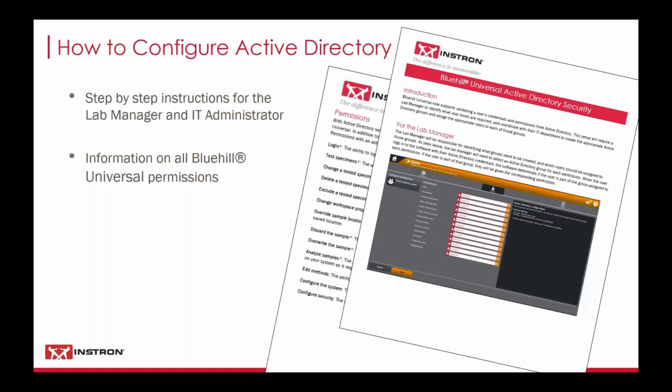And if you're interested in setting up Bluehill security with Active Directory, similar to that demo that we just went through, we have a helpful document that you as the lab manager or super user can share with your IT department. The document is on the Instron.com website on the Bluehill Universal product page.